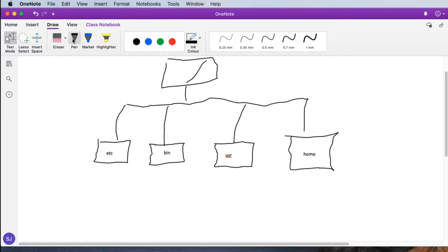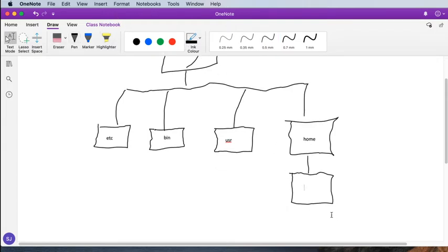and here goes my shonky drawing again. Totally exactly the way that I wanted to do this, really, I promise. Here's another box drawn with a trackball mouse. There we go. So this is a directory that lives inside our home directory, and in there will be a directory which has your username.